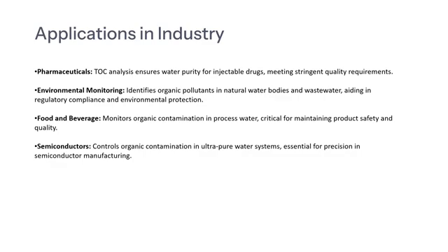Then we will discuss the applications and technical insights of TOC. As discussed earlier, TOC analysis is vital in industries such as pharmaceuticals, environmental monitoring, food and beverage, and semiconductors. The technical precision of TOC analyzers ensures compliance with stringent regulations and enables process optimization in these industries.